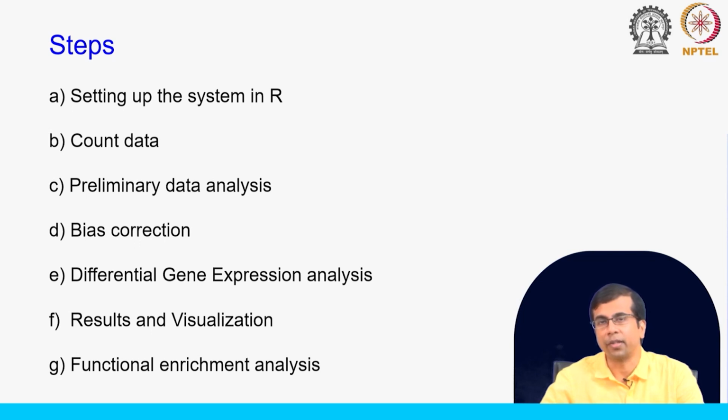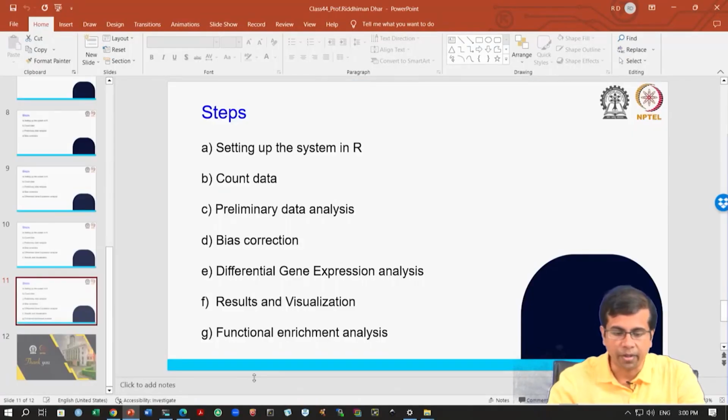We will have first a brief introduction to R, how to set up R, and very basic commands in R, followed by setting up the system for the data analysis. And then, if time permits, we will also talk about the data loading, and we can load the count data and look at some of the characteristics of the count data. Let us now move on to the system.